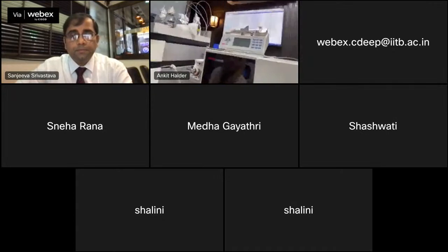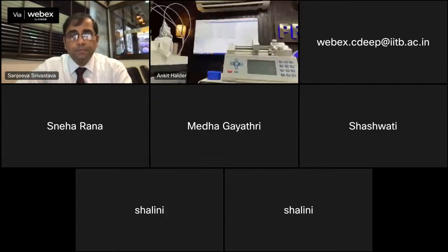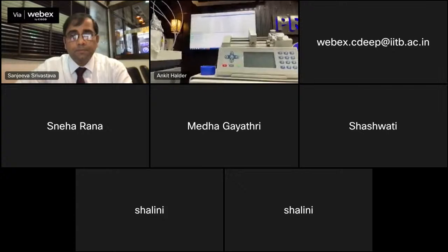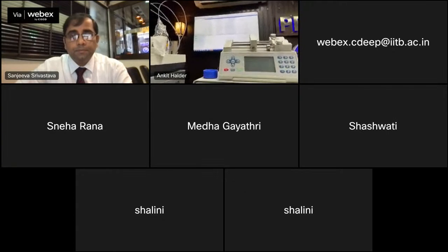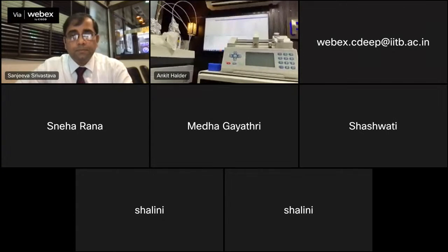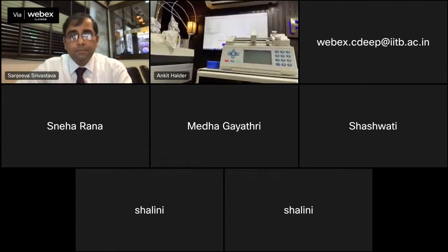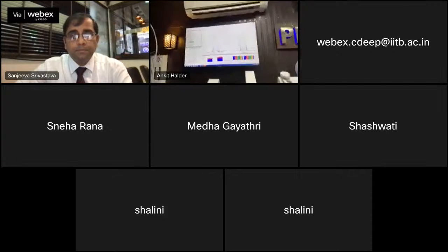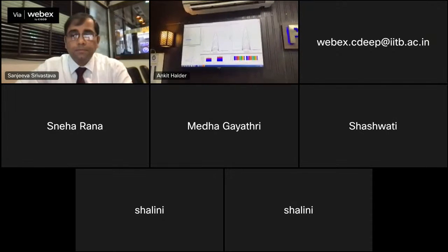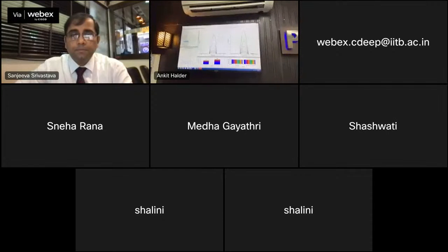So once we have created the method, named the sample, and set up the particular method and injection volume, we run the sample. Over time, when the sample is run, finally we get the data, which we further analyze again in the same software from which we have taken the transition list or the target list. So this is the interface of the Skyline software.